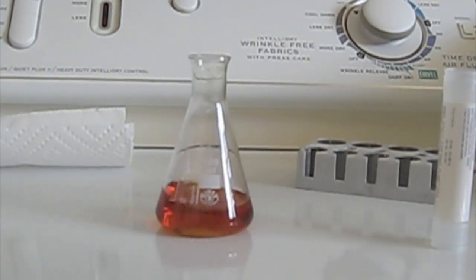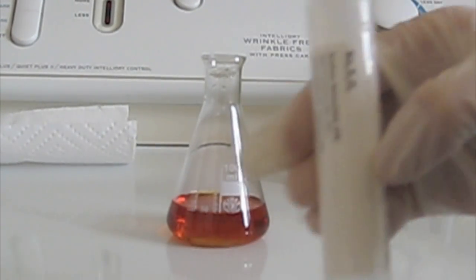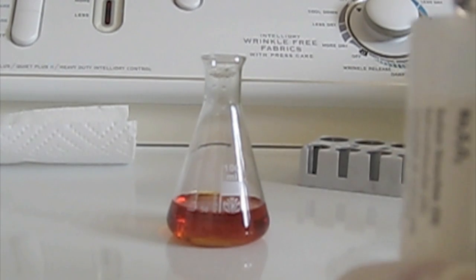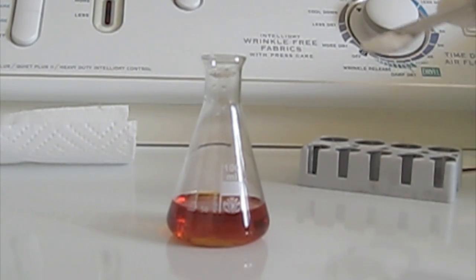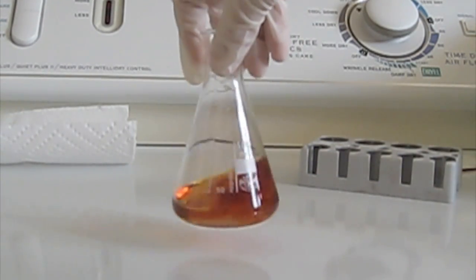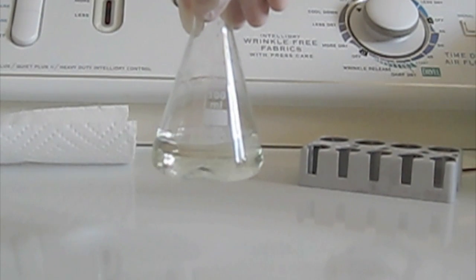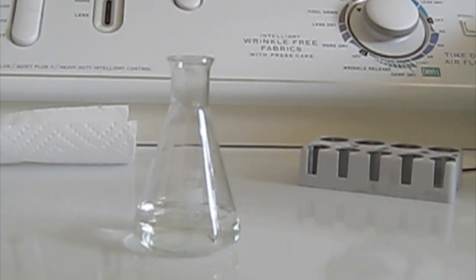To give you a better view of the reaction of sodium thiosulfate and iodine, here's the leftover filtrate of iodine solution. And as I add the sodium thiosulfate, watch what happens. As you can see, the solution is brown, and when I swirl the flask after adding sodium thiosulfate, it becomes clear. This can be poured down the drain because sodium iodide is not much of a toxic chemical.